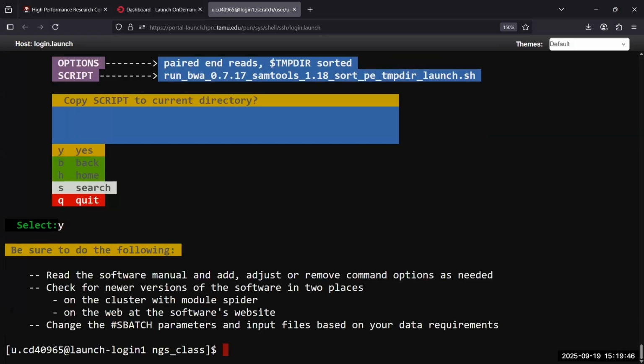Okay. So don't submit it yet because we need to change the input files. We need to use our trimmed reads. So does everyone have a copy of the file? You got a copy? Did you get a copy? Okay. Okay. Let's go page for home. And then type number 3.